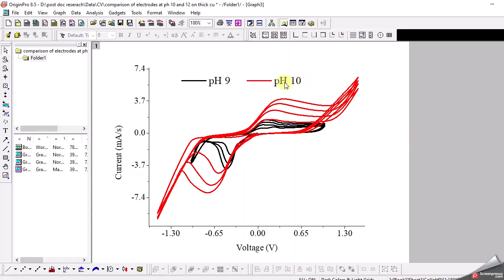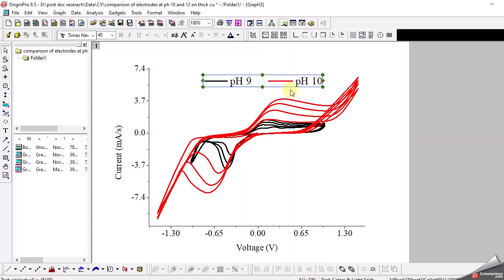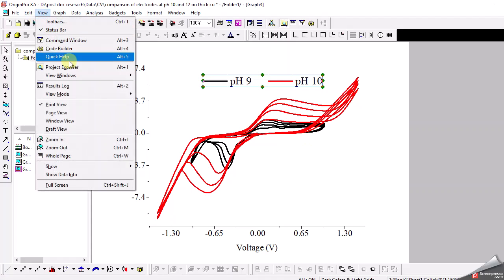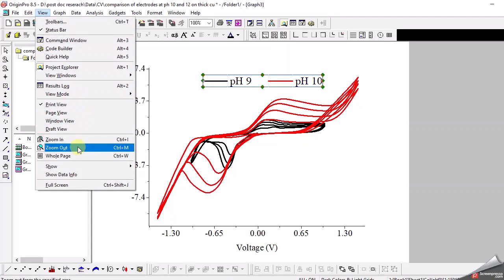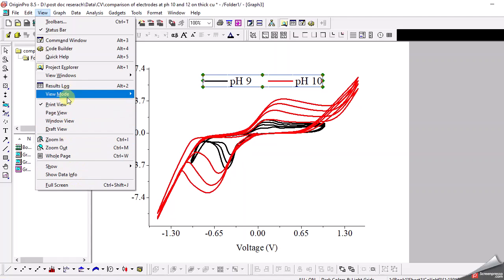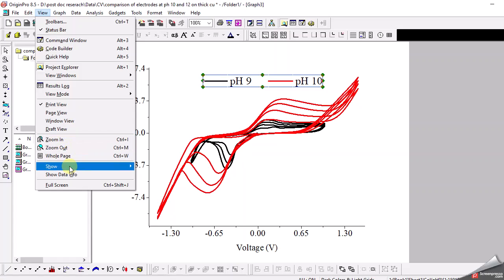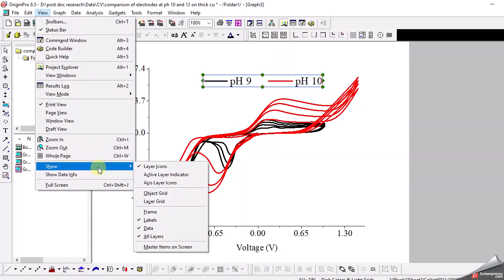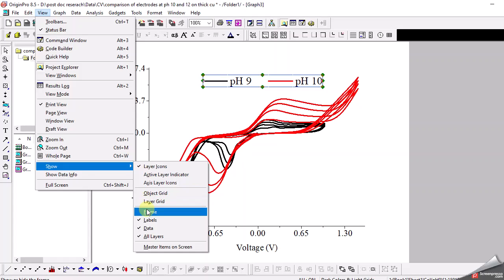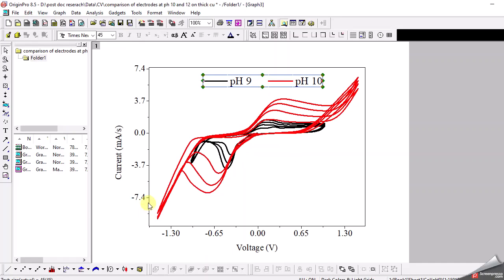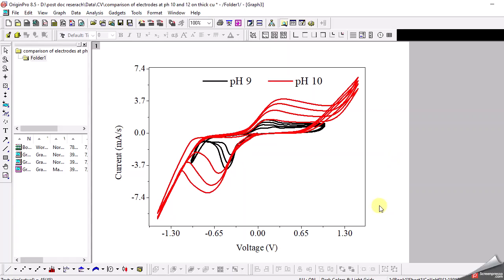To give a more aesthetic look to my graph, I also go to the view menu and select the show option where I select the frame option so that we have a nice frame in the graph. And here it is.